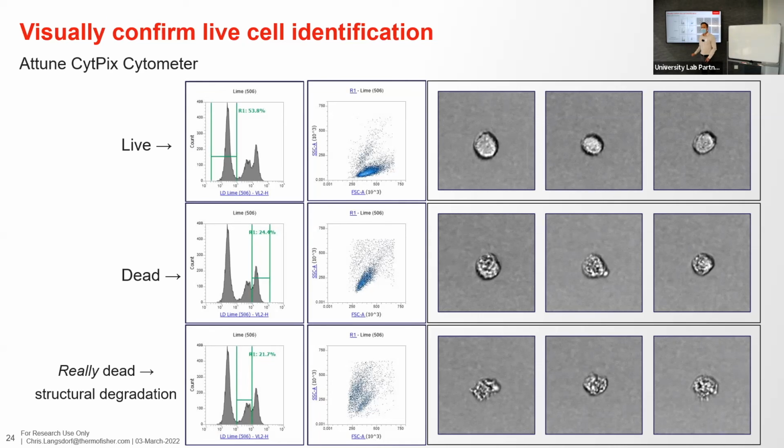So the second row is apoptosis, third is necrosis. Potentially, yeah, depending on the treatment. It could be. So in this case, if you want live cells, it's easy. But either relying on scatter, knowing that forward and side scatter change along with viability, or looking at the image, it really helps you clarify.